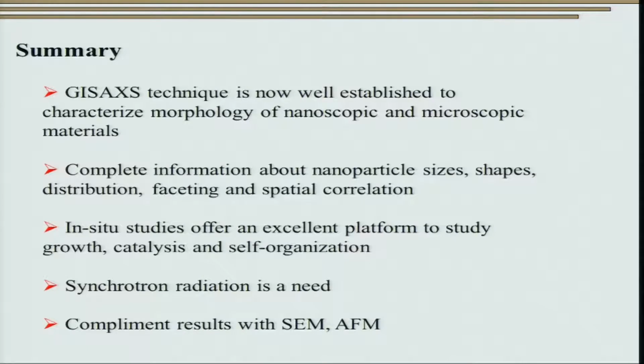Okay. So, to summarize, I hope you appreciate that grazing incidence small angle X-ray scattering technique is now well established to characterize morphology of nanoscopic and to a certain extent microscopic particles. For microscopic particles, we essentially do not really need grazing incidence small angle X-ray scattering, but for nanoscopic particles, this is probably the only technique to give you a lot of information while doing in situ experiments. We get complete information about nanoparticle sizes, shapes, distribution, faceting as well as spatial correlation.